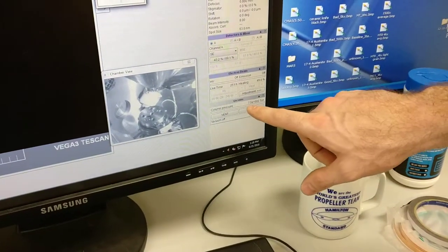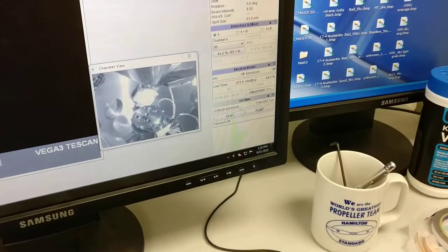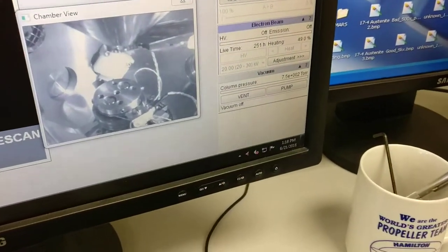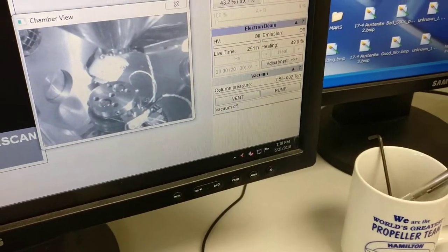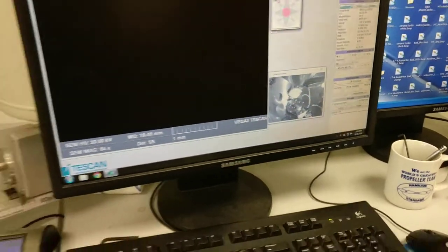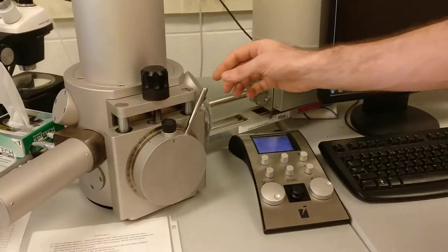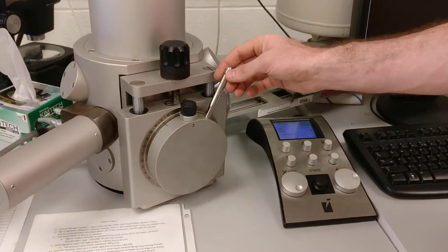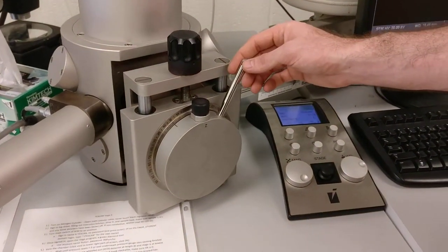When the pressure is about 7.5 to the plus 2 torr, we're going to open up the door. Very gently just slide this open.